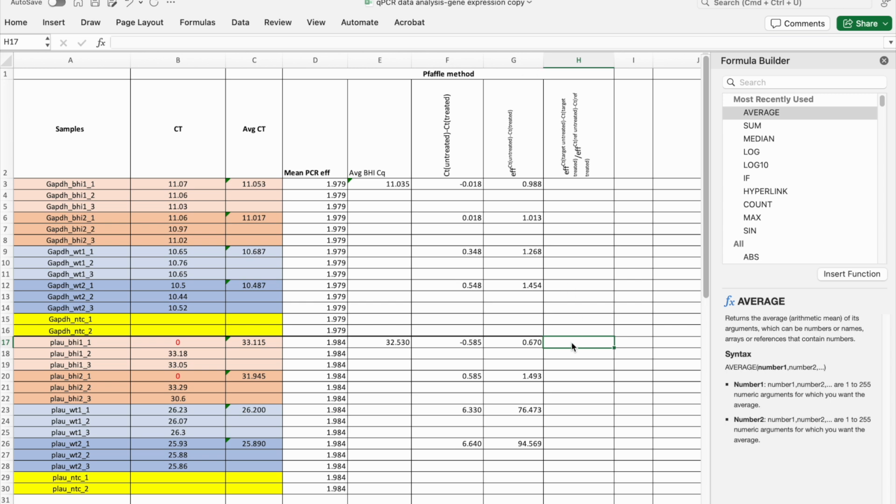So how can I do this? Equals this target divided by this BHI. We have to align between these two different groups. I will do the same here, and as there's no data there, it's all going to be infinite or not calculated.